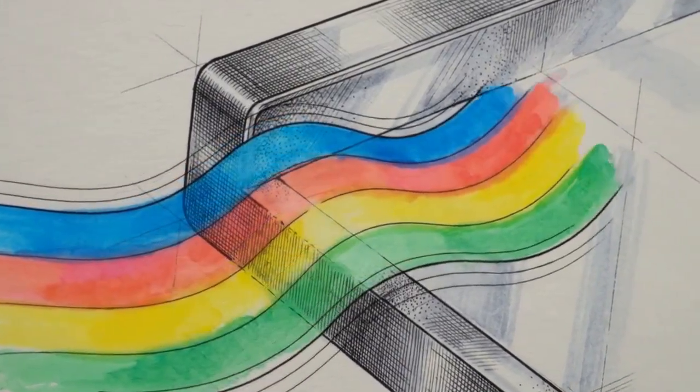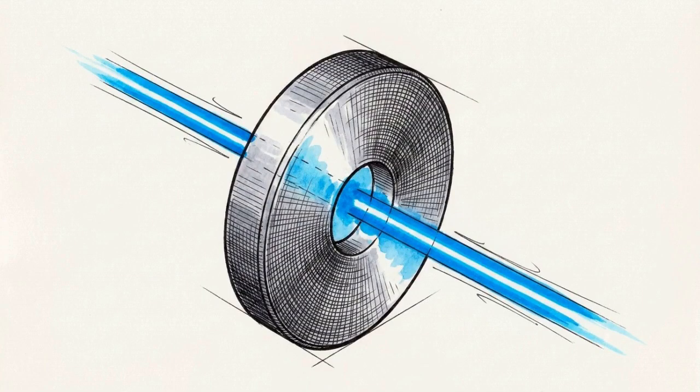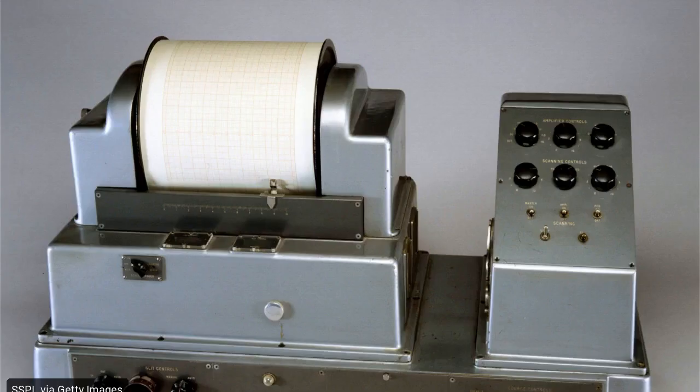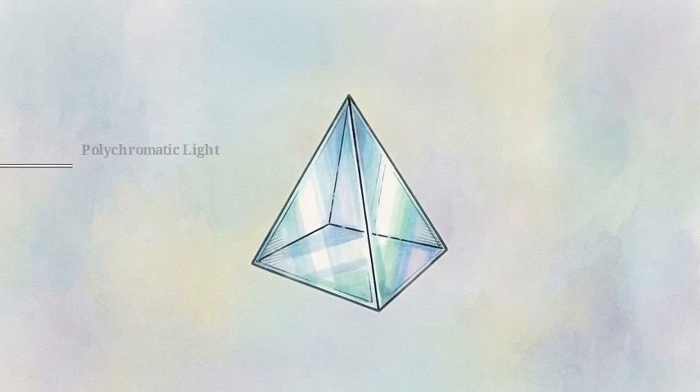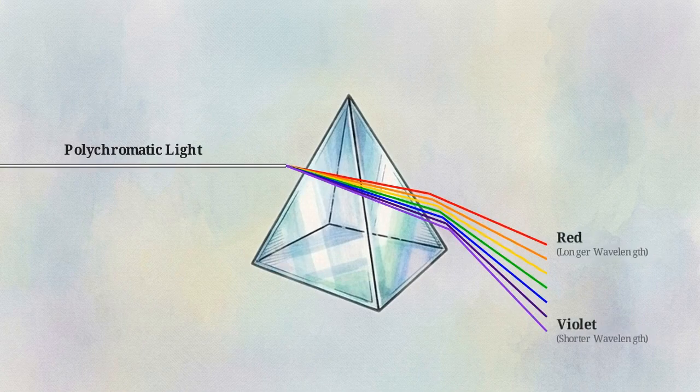However, their physical thickness is permanently fixed. They provide an excellent beam, but only for a single unchangeable wavelength. To continuously scan across a full spectrum, researchers require an instrument that can dynamically change its output, a dispersing monochromator. Early monochromators used prisms. They operate via refraction, where a material's refractive index varies by wavelength, causing shorter, higher energy light to bend at sharper angles.